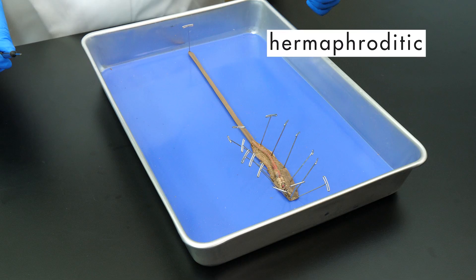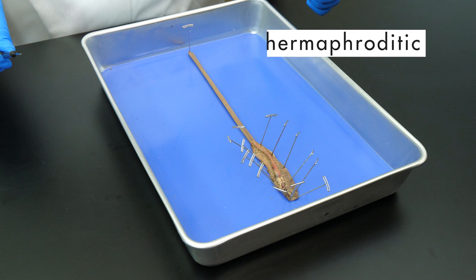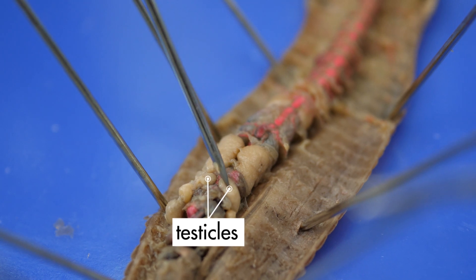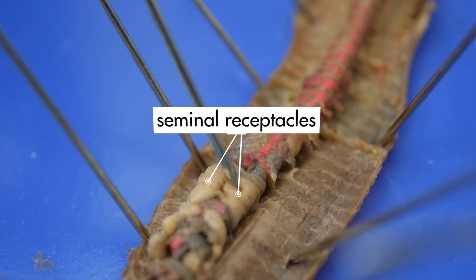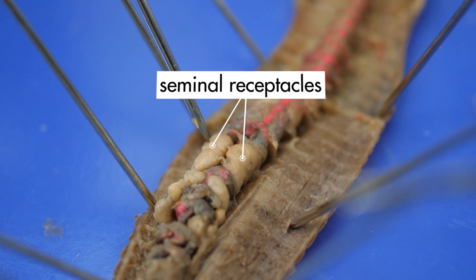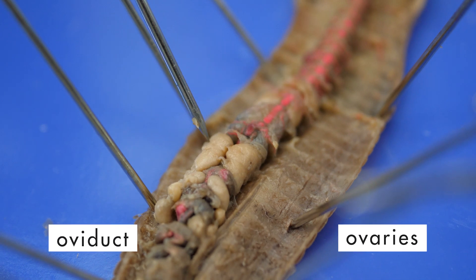An earthworm is hermaphroditic, which means it produces both male and female gametes. These light-colored structures are the testicles, which produce sperm. These structures are the seminal receptacles, which store sperm from another worm. The ovaries and oviduct are beneath the esophagus, so we cannot see them. The ovaries produce ova, or eggs.